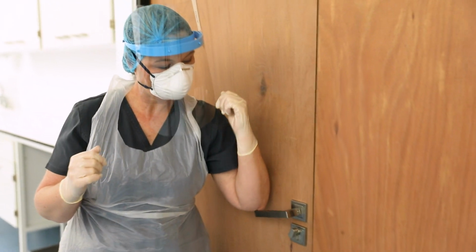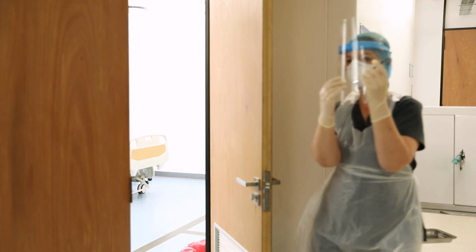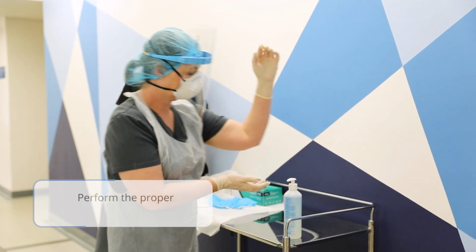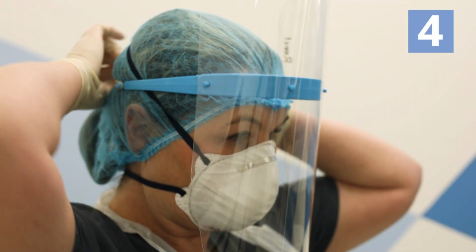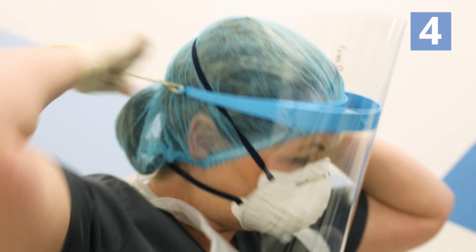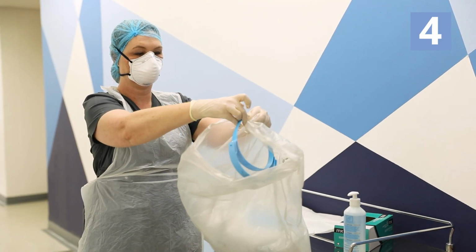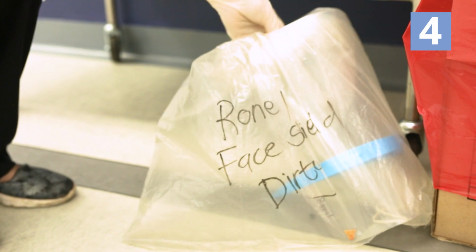You should now move out of the contaminated area or patient room into an anteroom. Perform hand hygiene. Remove your goggles or face shield from the back of your head by lifting the bands or earpieces. Place them in a designated container or area for disinfecting.